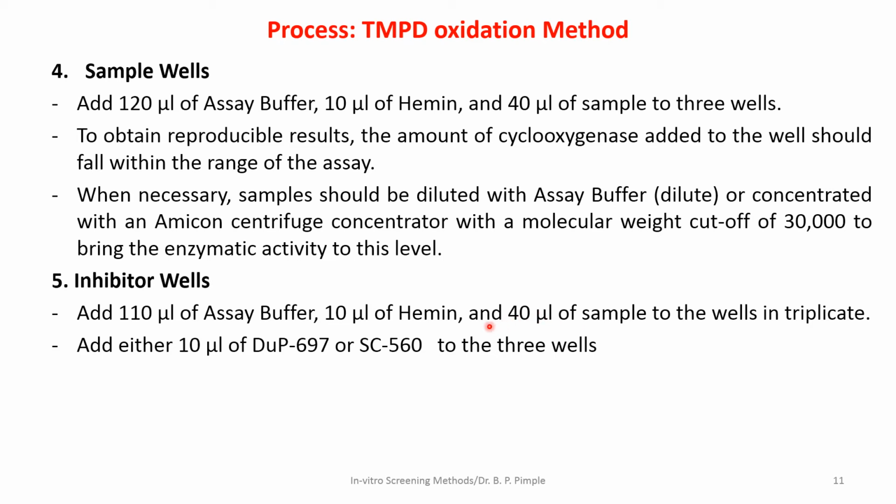is inhibiting the COX-2 enzyme, or whether you need to compare it with the SC560 inhibitor or DUP, that is the COX-1 inhibitor.